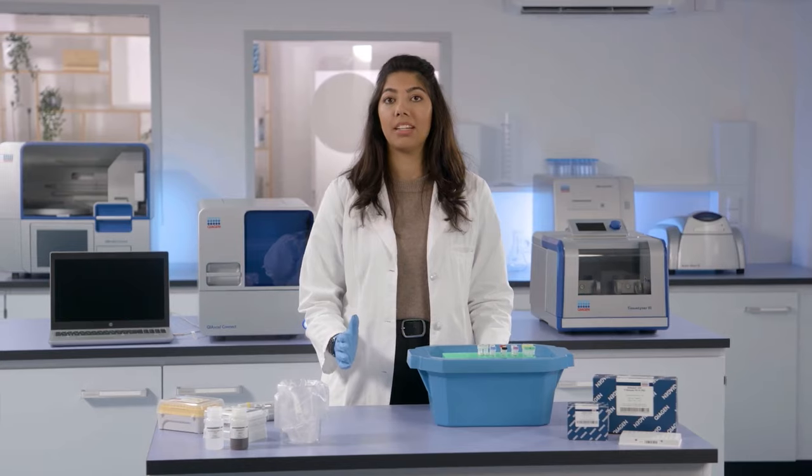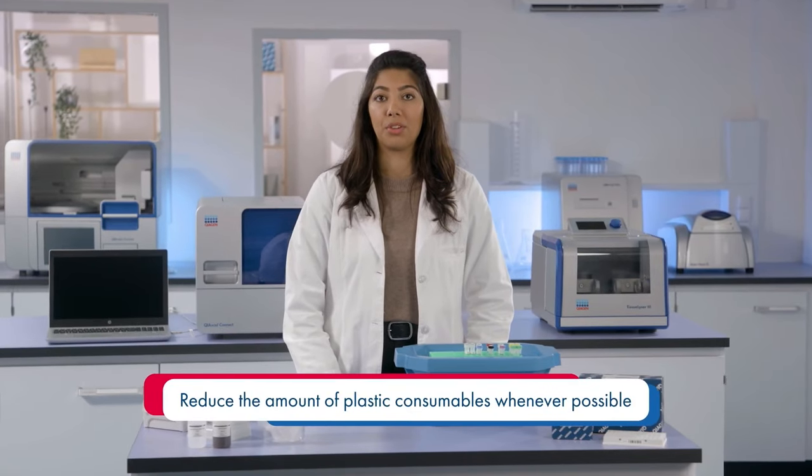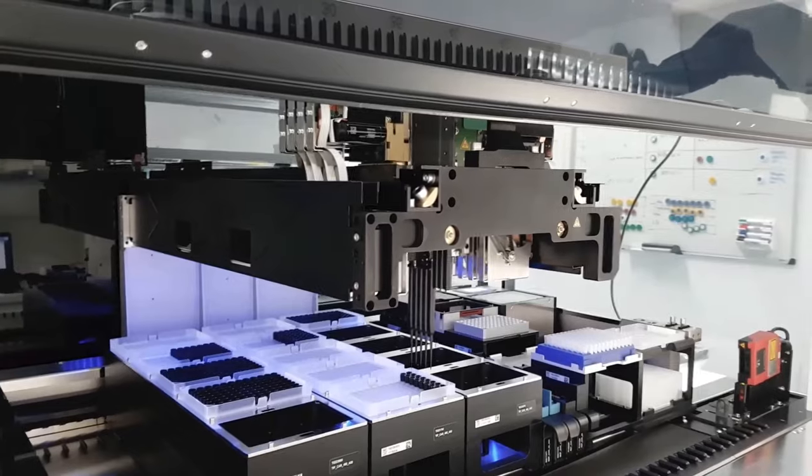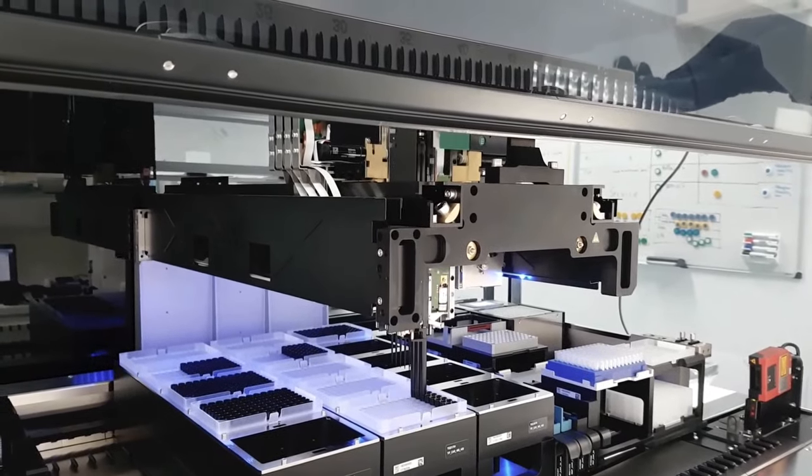The NGS library is ready for sequencing in just two and a half hours. With sustainability in mind, it's important to reduce the amount of plastic consumables whenever possible. The simple QIAseek library prep workflow can easily be automated on a variety of liquid handlers to meet high-throughput library prep needs. Now the NGS library is ready for sequencing.